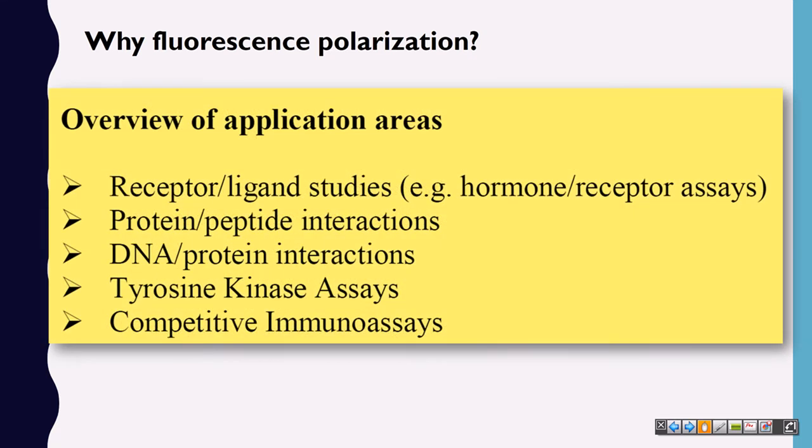This fluorescence polarization technique has wide applications in many areas of research, and I can't include all of them here. Basically, it covers protein-protein interaction, protein-peptide interaction, receptor-ligand studies, and DNA-protein studies. Wherever you feel there are changes in molecular size, you can use this technique easily.